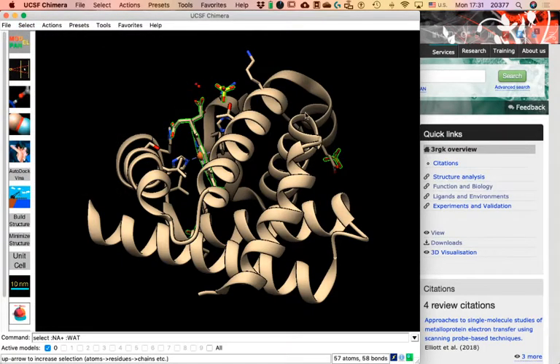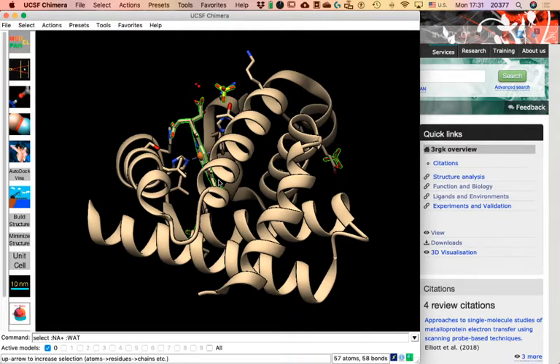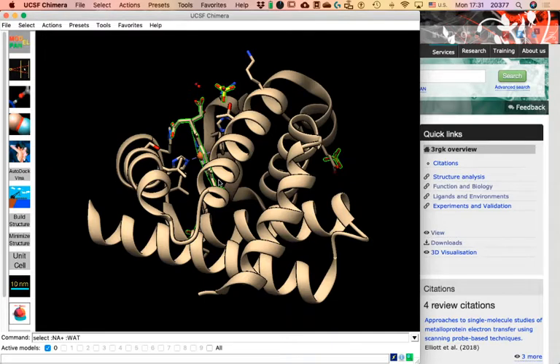Notice at the bottom of the screen you get a magnifying glass highlighted in green, and it tells us that 57 atoms and 58 bonds are selected. In this program you can select just atoms or just bonds, but here because I selected Ligands, both were selected and highlighted in green. I usually leave the highlight color as green because it's hard to miss.